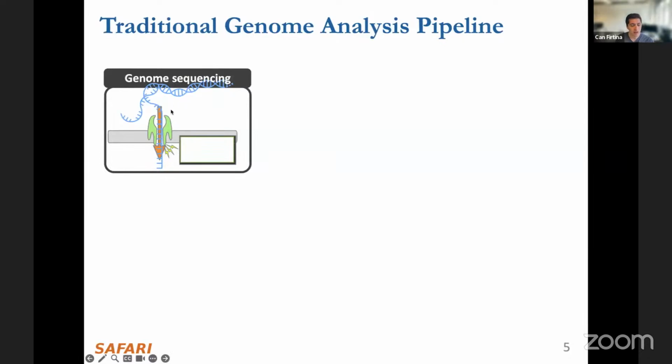In nanopore sequencing, we have a few parts that play an important role in sequencing the DNA molecule. In this picture, the middle part is usually known as the membrane, where we have a steady current flow. You can assume that the top part of this membrane is negatively charged in terms of the ionic charges, and the bottom part of this membrane is usually positively charged.